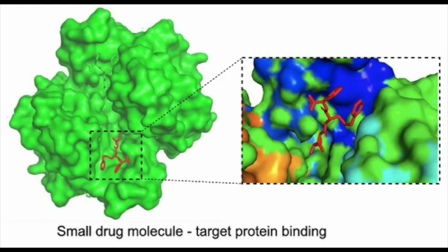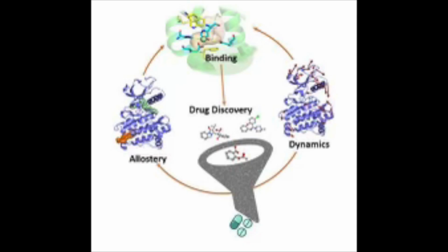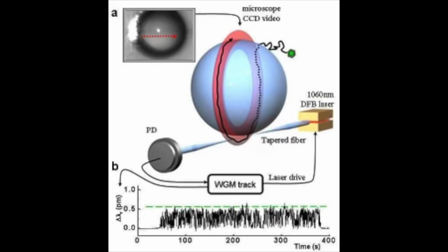The issue, however, is that a big aggregate could non-specifically bind, causing a false signal to be shown. Usually, scientists would have to run the experiment again, with an aggregate preventing detergent to stop the false signals. But with our work, we are trying to make the WGM detect flyby events or direct attachment of the aggregates to the sensor, which it couldn't do before.